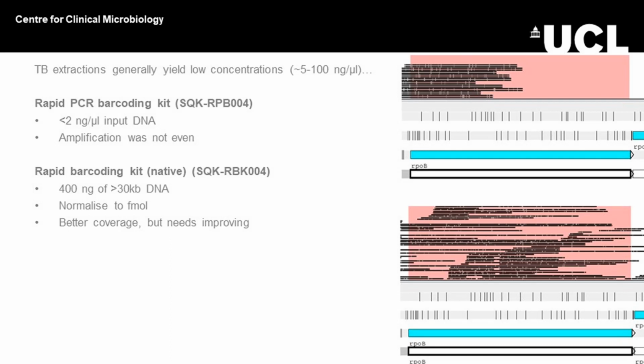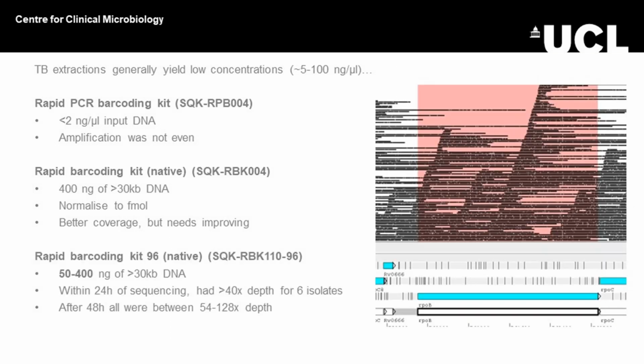However, having said that, and I can talk about this later if anybody wants to know, TB, I think, is forming primer dimers or sort of balls as it goes through because it's got so many repeat regions and it's clogging up the pores. So we did an experiment and actually found that having somewhere between 10 and 20 kb was actually better. So don't tell Nanopore.